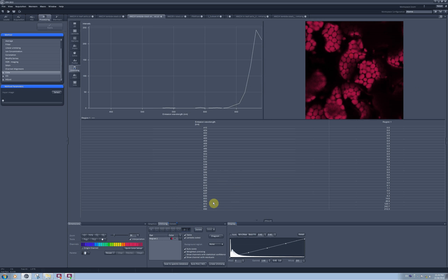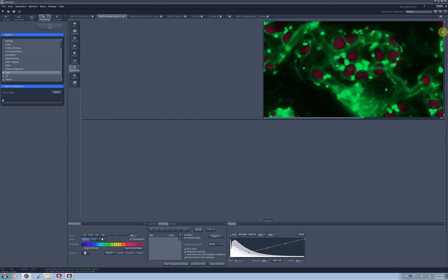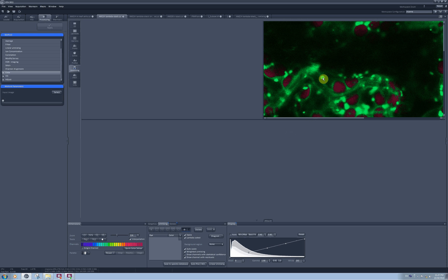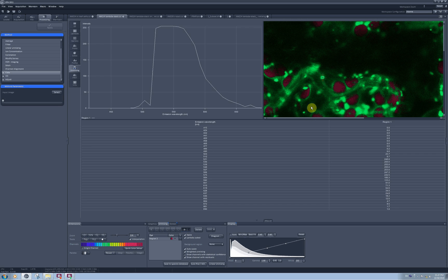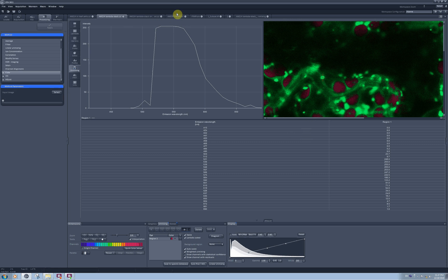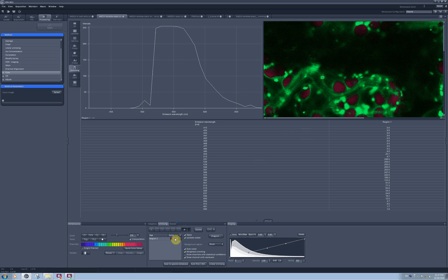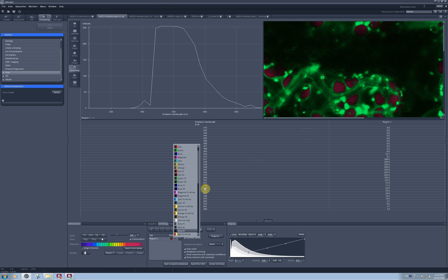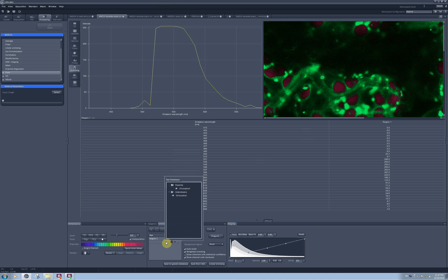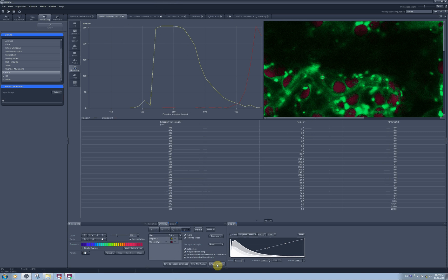Optimally, I should also have a spectra for only YFP in my sample, but this is very difficult to achieve. And now I can go back to my lambda stack and I will try to find the component from the YFP channel which definitely shouldn't contain any red fluorescent signal. And here it is. This is obviously not an optimal image because it's oversaturated. This curve should go higher than 255. And then I can unmix this component. I will annotate it with yellow color from the chlorophyll by clicking on plus button here. I can add the chlorophyll from my database and select linear unmixing.